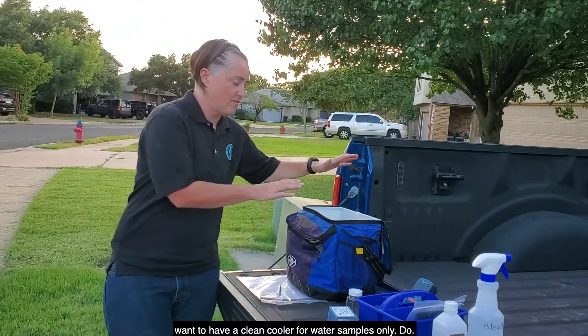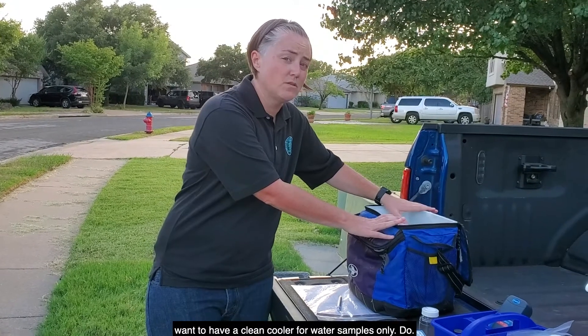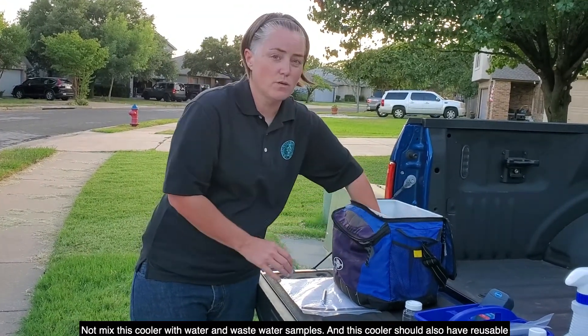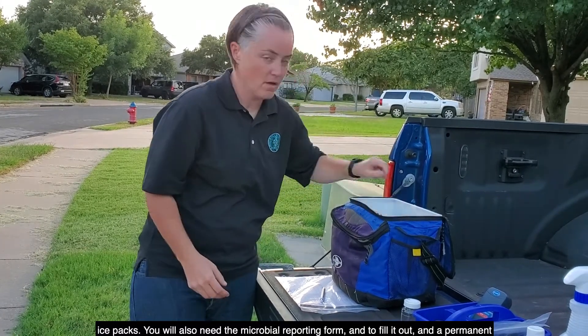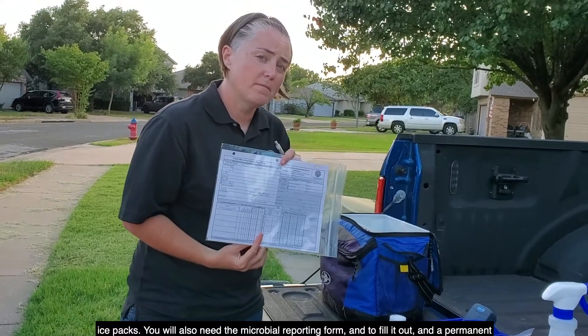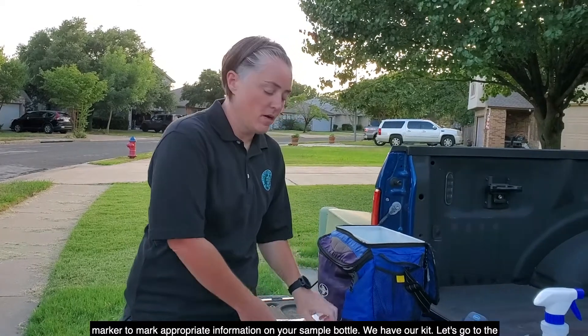You'll also want to have a clean cooler for water samples only. Do not mix this cooler with water and wastewater samples, and this cooler should also have reusable ice packs. You will also need the microbial reporting form, a pen to fill it out, and a permanent marker to mark appropriate information on your sample bottle.